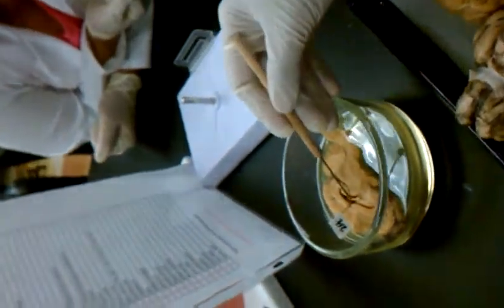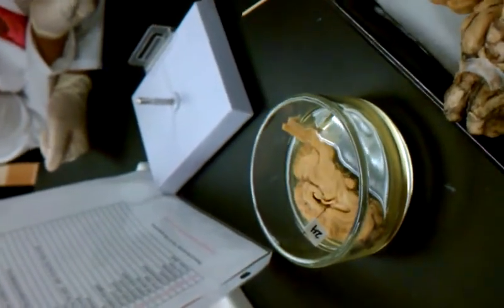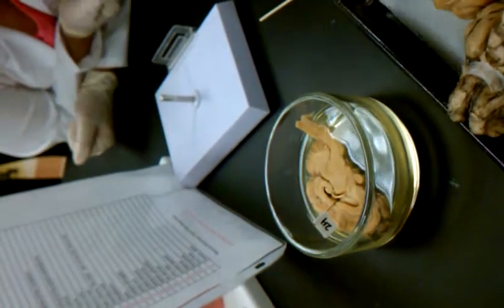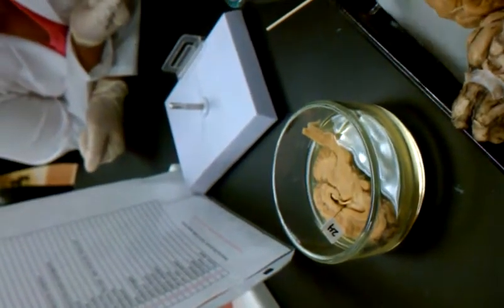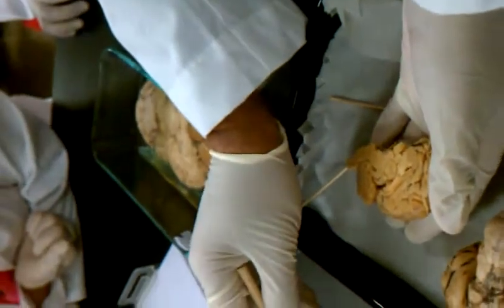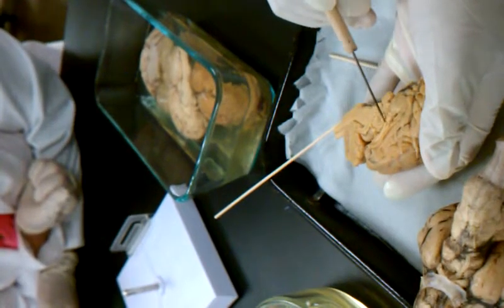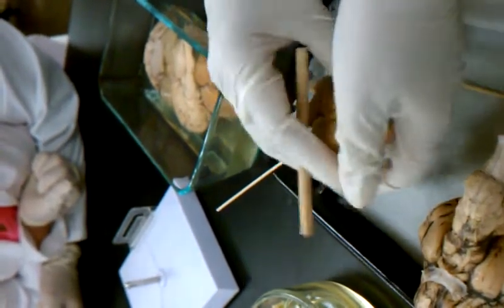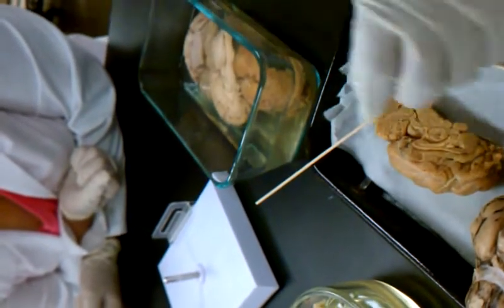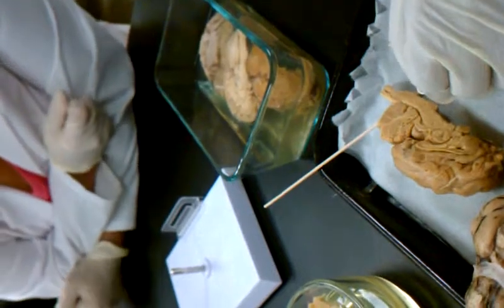Lateral ventricle is the space, the cavity. You have one on the right, one on the left. Both are separated by a membrane, which we call the septum pellucidum. So where is that membrane? If you see here, you see the complete cavity, here you don't see, right? Because the membrane covers that. Here also you don't see because septum pellucidum covers that. This one is without a membrane.